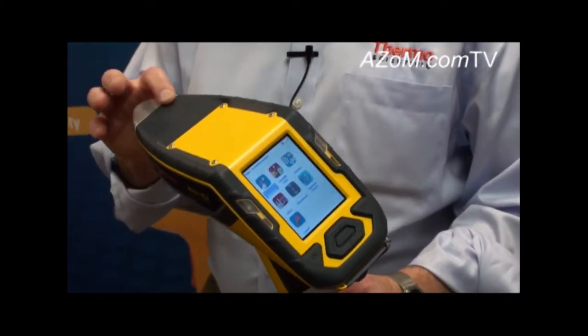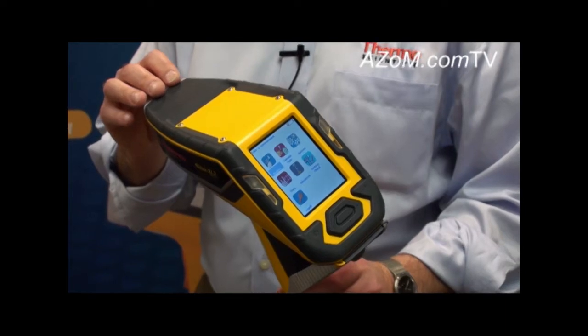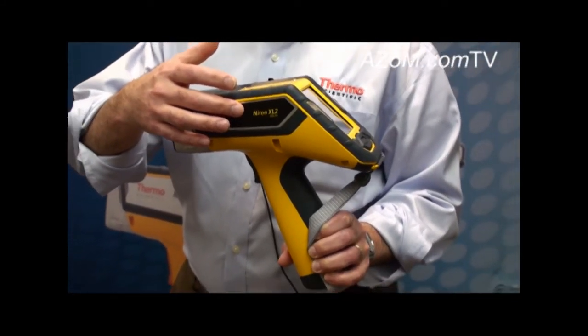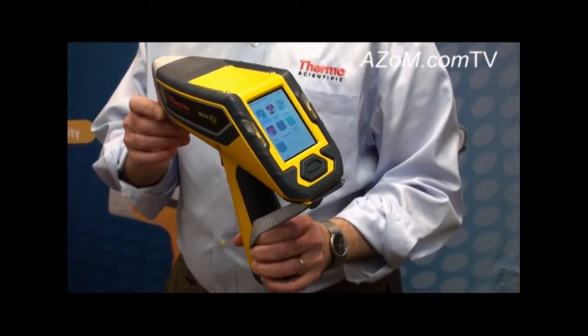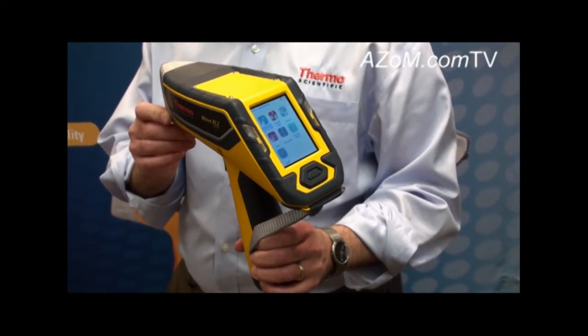The Niton XL2 platform was introduced last year and upgraded over the summer to include our GOLD technology. GOLD stands for Geometrically Optimized Large Drift Detector. What this does for our users is it provides them with the ability to see light elements such as magnesium, aluminum, and silicon in metal alloys.